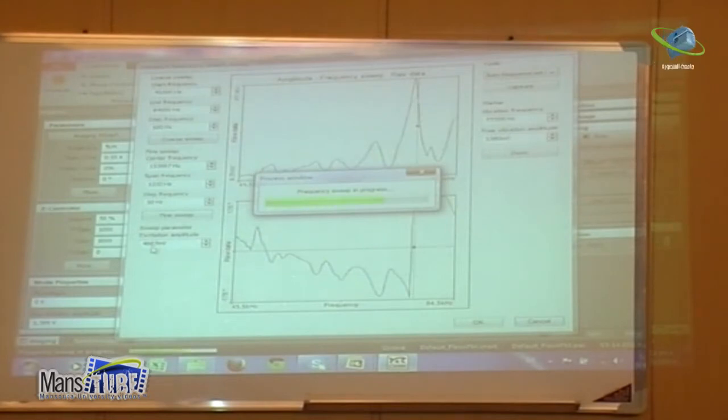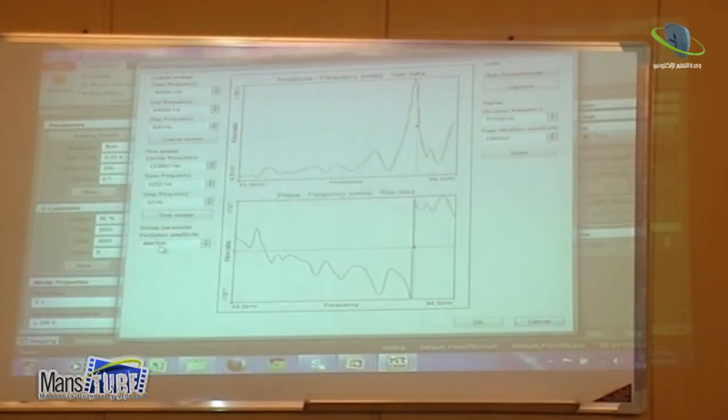This is the maximum value, and with this maximum excitation of 5000, I reach 1400. This is the maximum amplitude I could reach. While in air, I was at 2000 here and maybe 500 there. This is the maximum excitation I reach.